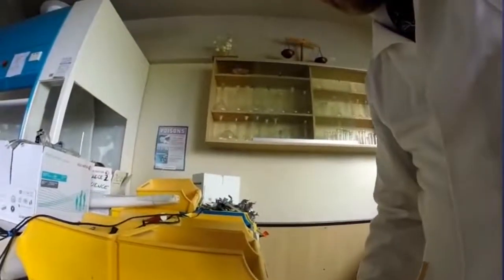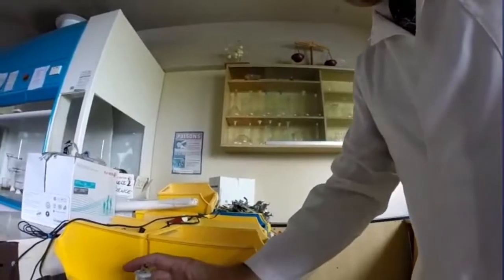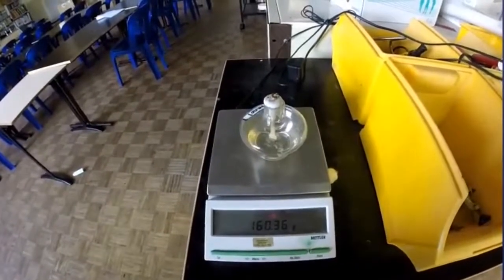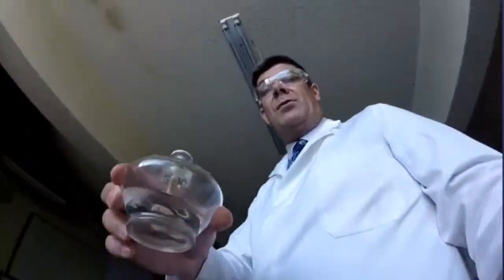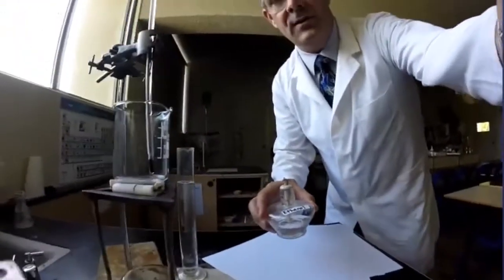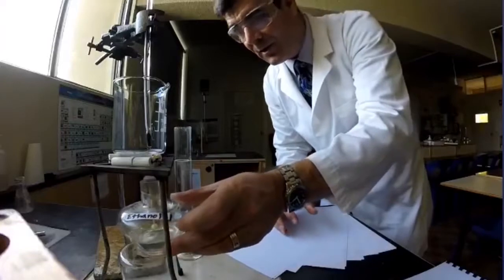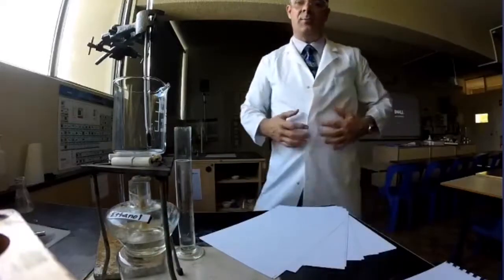So the first thing that I want to do is zero my balance, and then I'm going to pop this on. And when I pop this on, I have a value, you can see here, of 160.36 grams. Now that's going to be important because I'm going to have a look at what weight of ethanol I have once this reaction has finished. So that's the first thing. I wanted to know my starting mass of my spirit burner.